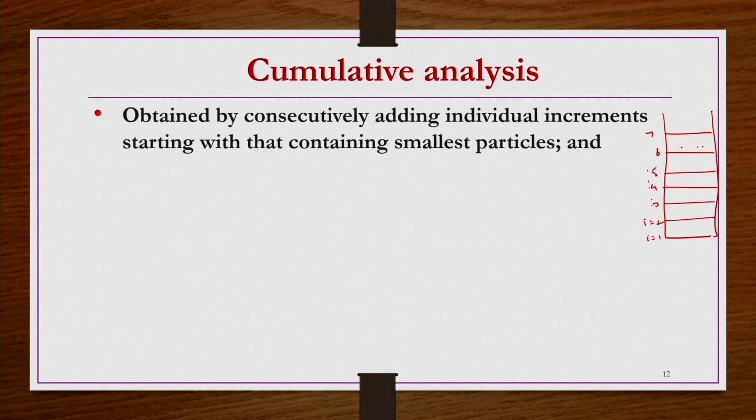Now, there would be some material retained on each of these screens, including the top one also, based on the screen analysis that we do, and then based on the nature of the sample, other properties of the sample, and screen opening etc. So, whatever the material that has been retained on each one, you assign some fraction x_i: this is x_7, x_6, x_5, x_4, x_3, x_2 and x_1, let us say.